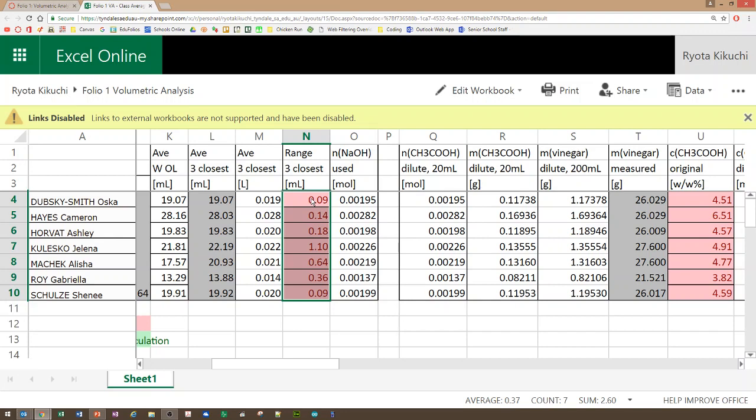Theoretically, everyone should have had 3 concordant values, all within 0.05 range. So if your values were within 0.10, because you can have a middle value and 0.05 plus and minus, that's considered, I guess, within a pretty good range. But where the first and the third value were away from each other, and the difference was more than 0.05, they're not really concordant as well.